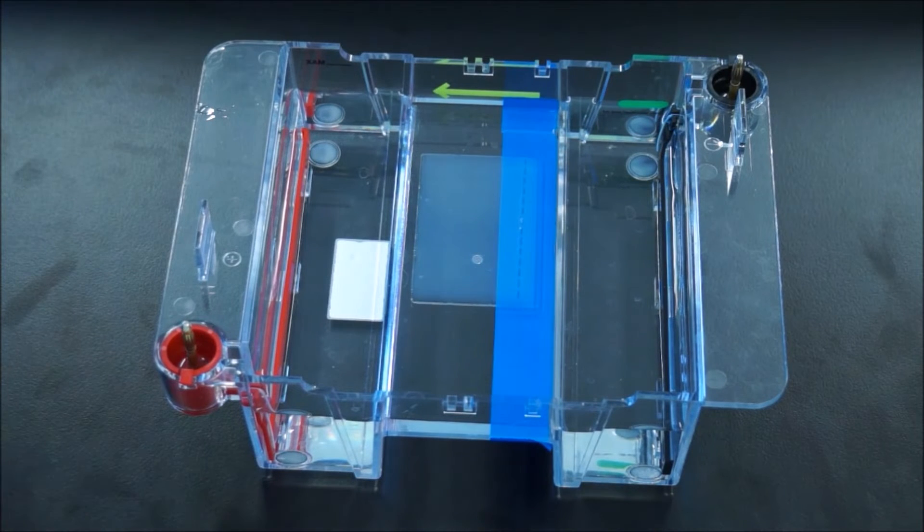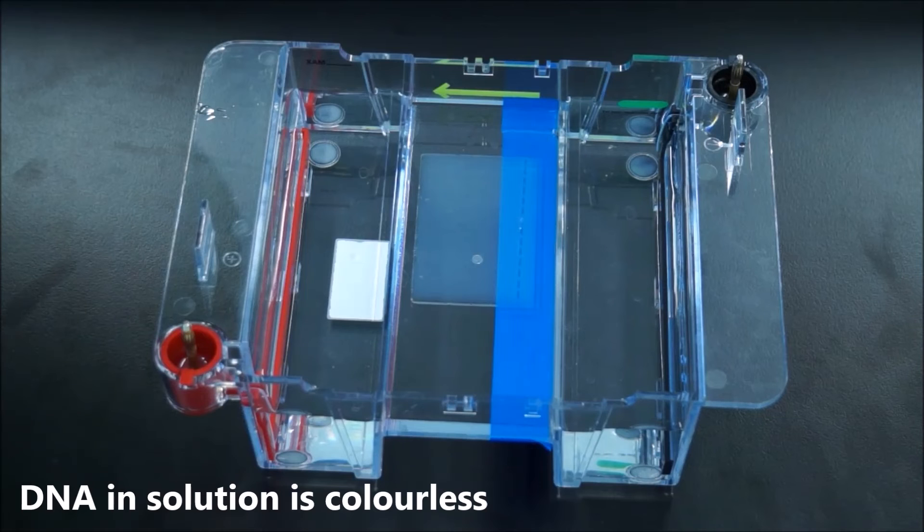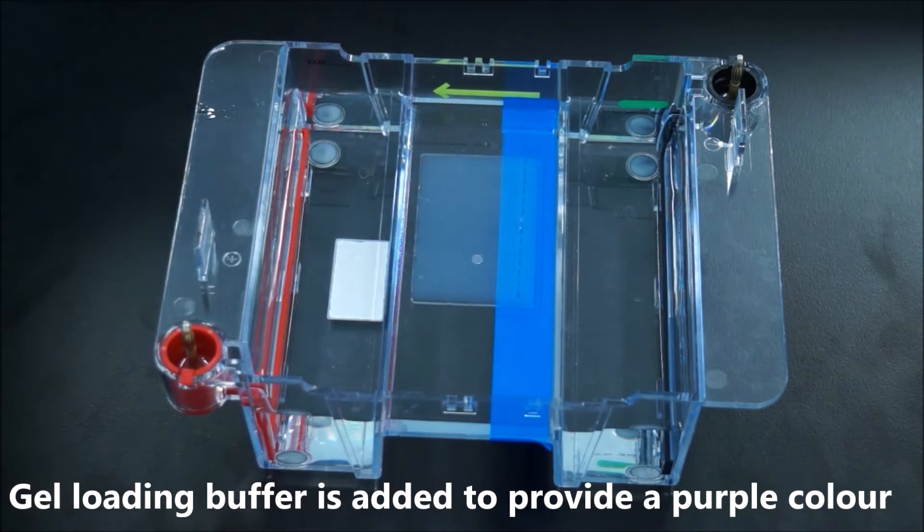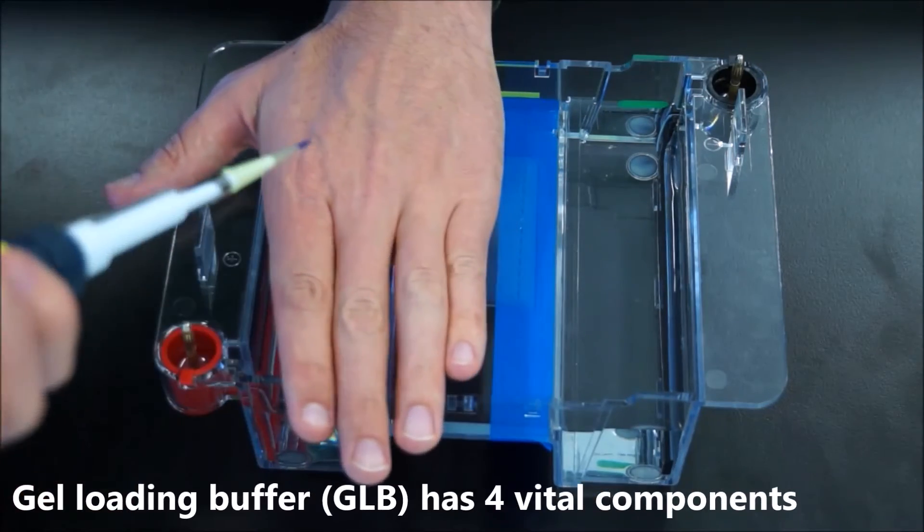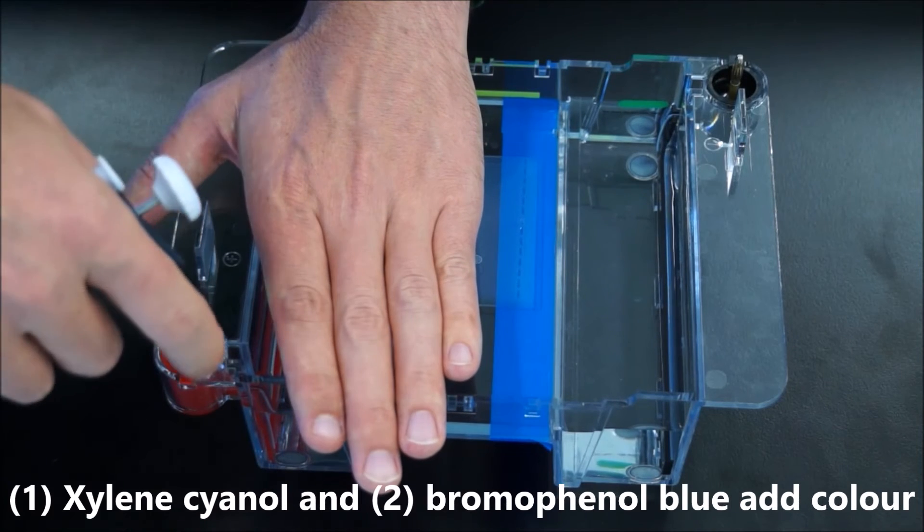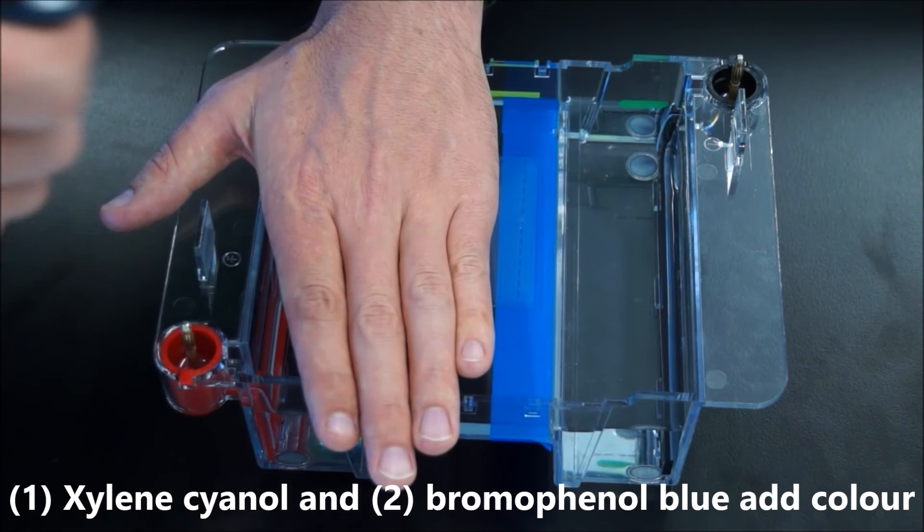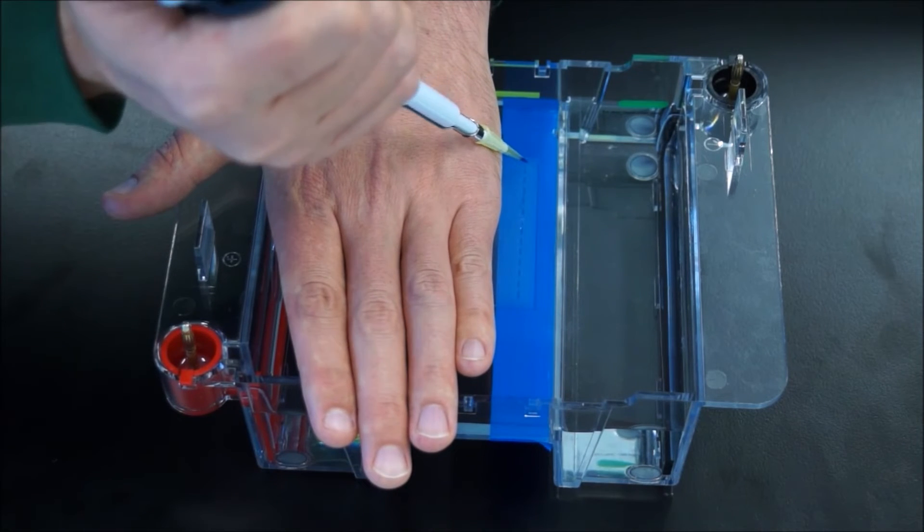Now we'll have to load the gel. There's a couple of tricks here. What I usually do is use my non-pipetting hand and get it as close to the gel as possible. It doesn't have to be pushing down on top of the electrophoresis tank, but it just acts as a place to support your pipetting hand.